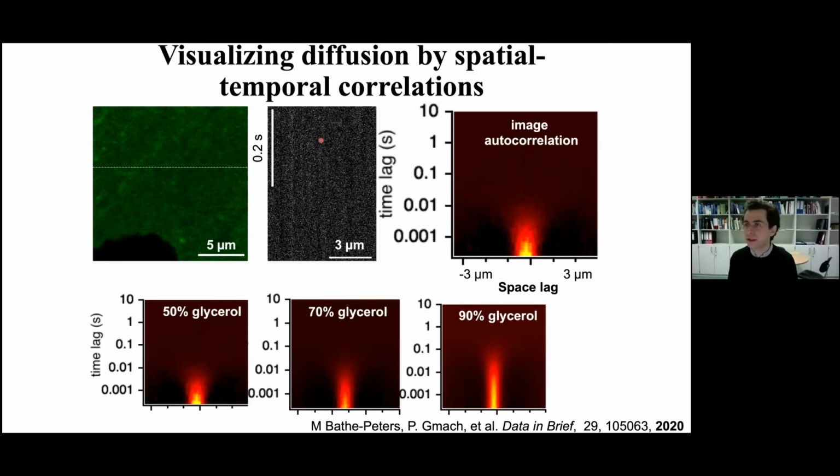But actually this noise encodes the information about the signal, the photons coming out of your fluorescent molecules which are exciting, and also the fact that they are moving. Because maybe a photon or a signal here, at this time, could have come from molecule 1. Molecule 1 could then diffuse and give you signal here. And is there any relation between the signal here and the signal there?